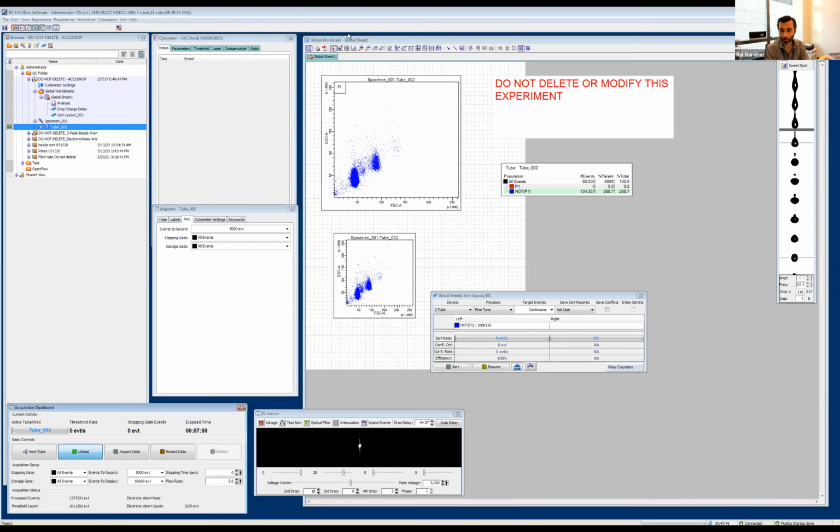I don't know if you guys have anything to add to that. No, I would agree with that. It's from the trigger laser, and the signals from the other lasers are married up in the electronics, so it doesn't really matter where they've been measured, whether it was before or after the trigger laser. Mm-hmm. Good.